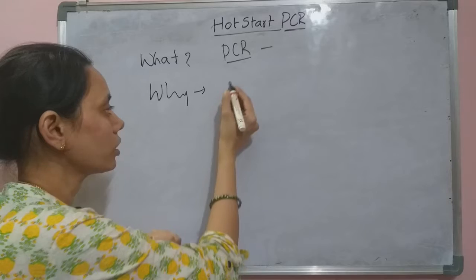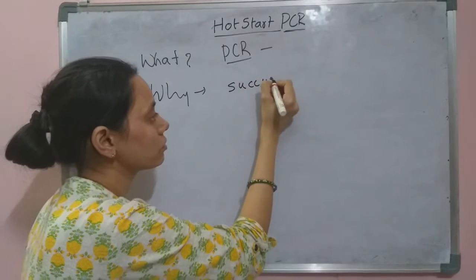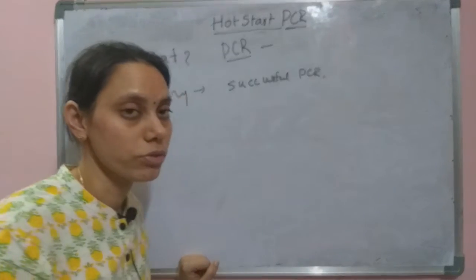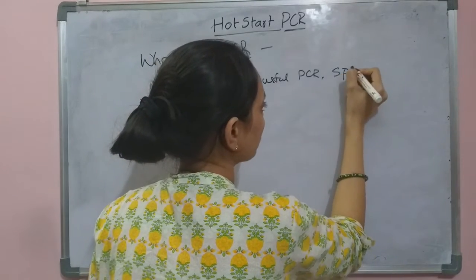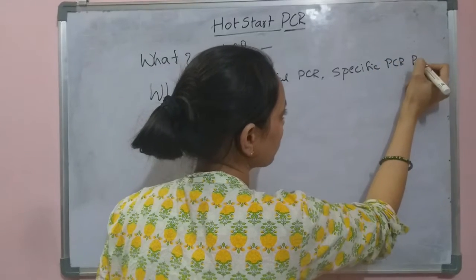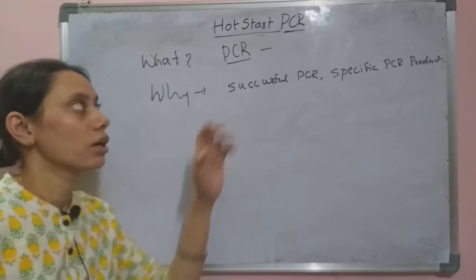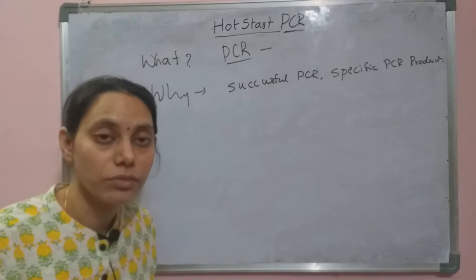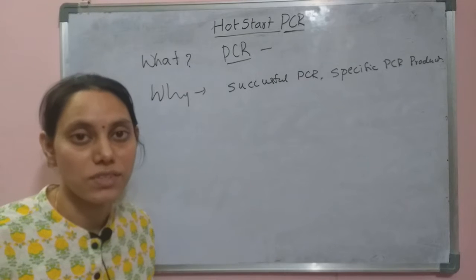In order to ensure a successful PCR reaction, and also to ensure a specific PCR product, for these two reasons we generally go for hot start PCR. It ensures a successful PCR product, which is highly specific to the target sequence.